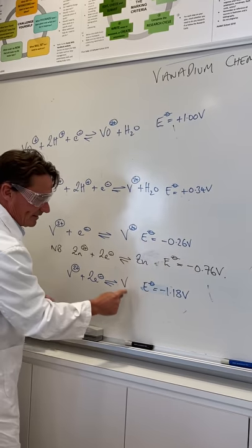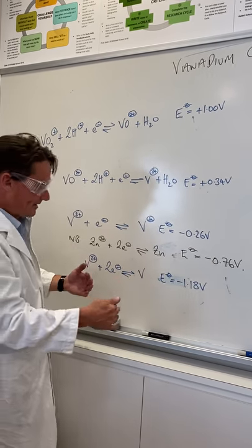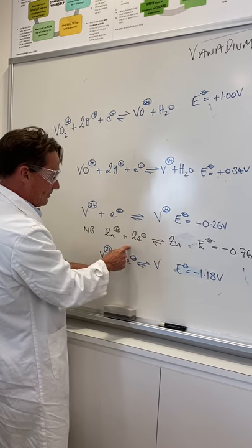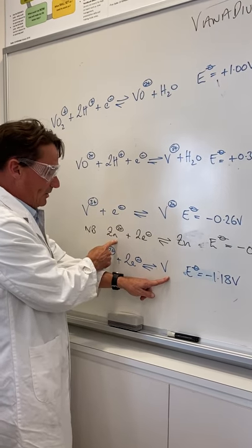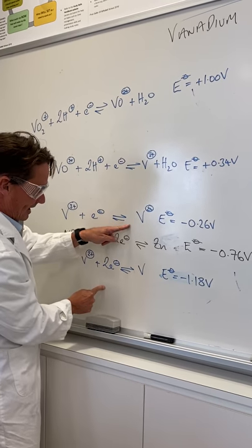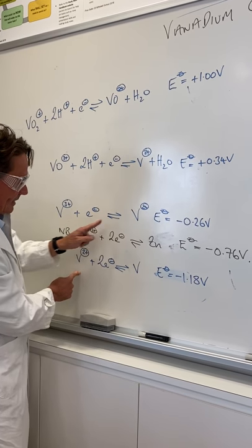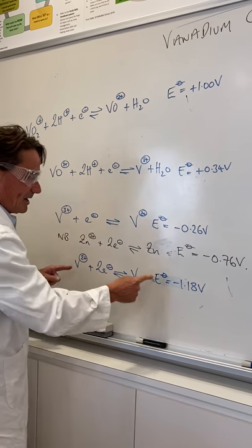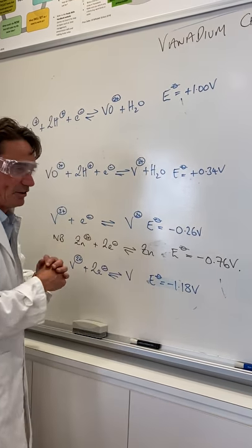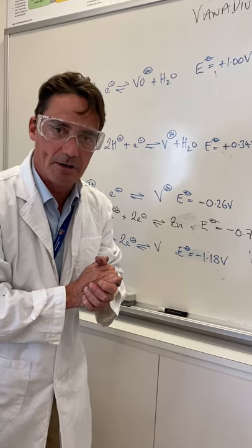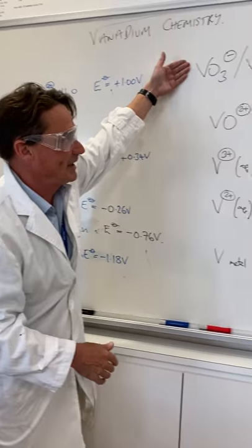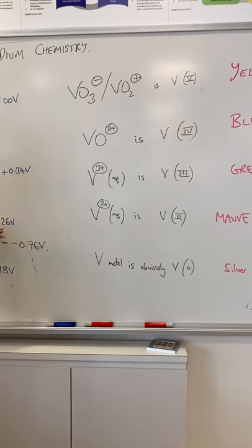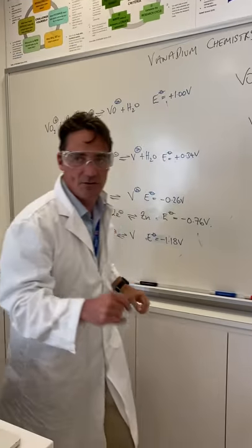Notice though that zinc isn't as reactive as vanadium as a metal. That is, zinc cannot reduce that because this is now more negative. So in fact, this reaction would happen the other way around, and zinc 2+ would turn into zinc, and vanadium would turn into vanadium 2+. So I can't reduce this all the way down to vanadium zero, but I can certainly get it all the way down from yellow to blue to green to mauve to vanadium 2+, which is what I'm going to do now.